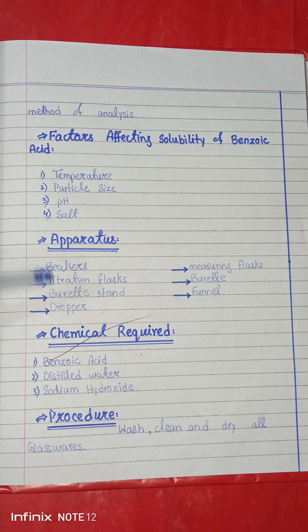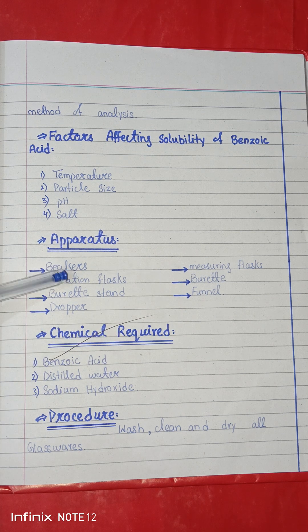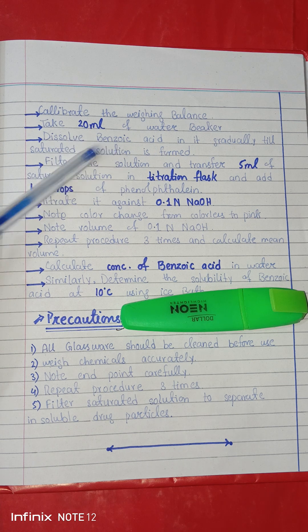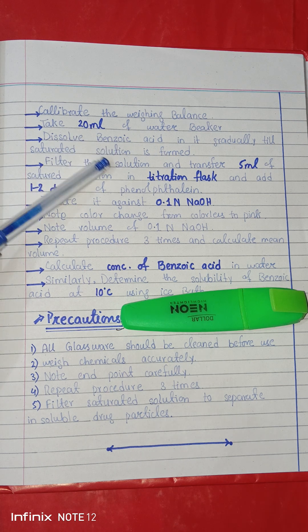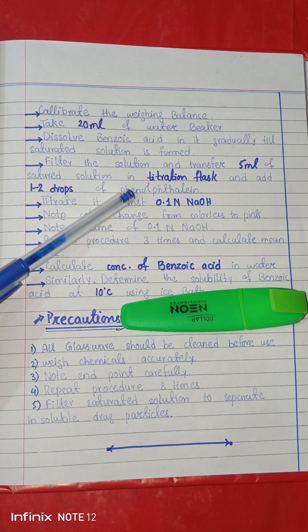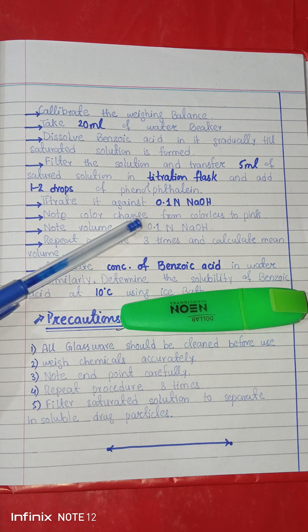The procedure is as follows: first, wash all the glassware you are going to use properly. Then calibrate your weighing balance. Take 20 ml of water in a beaker, add benzoic acid, and dissolve it. Transfer the solution into a conical flask, add phenolphthalein indicator, and then add 0.1 molar NaOH.